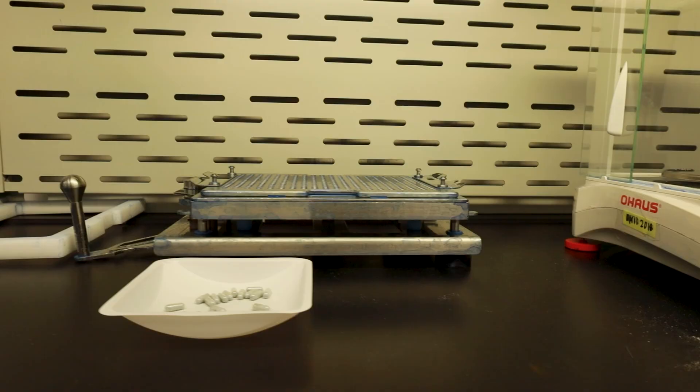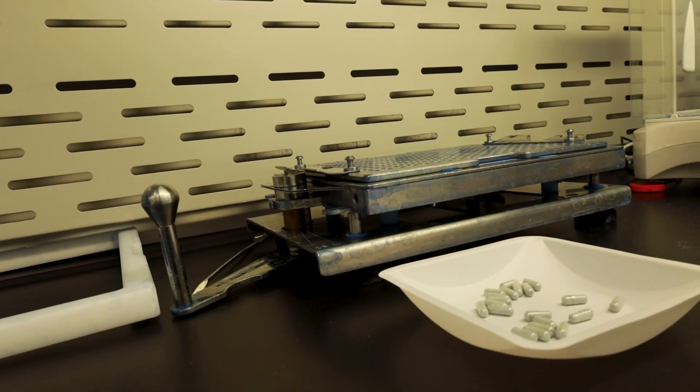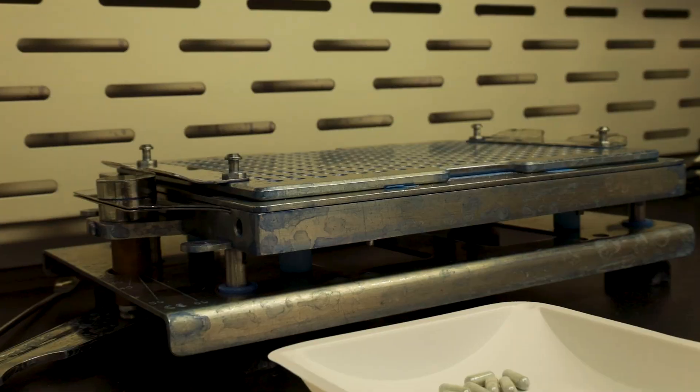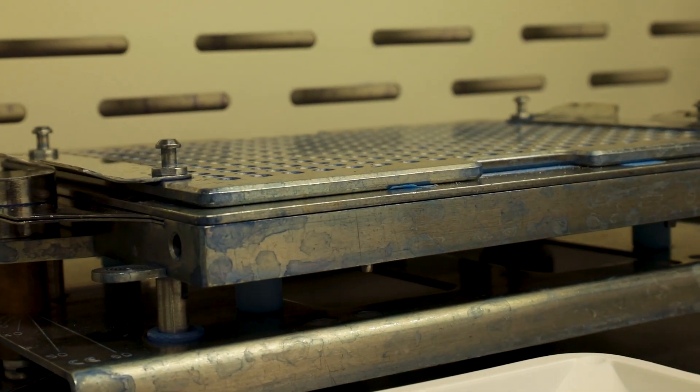We built this lab with this intention to make sure we've got a very clean product going to the consumer, ensuring that there's no other cross-contamination with any other drug that we compound here.